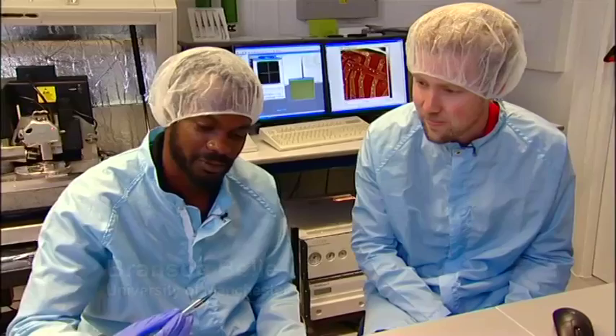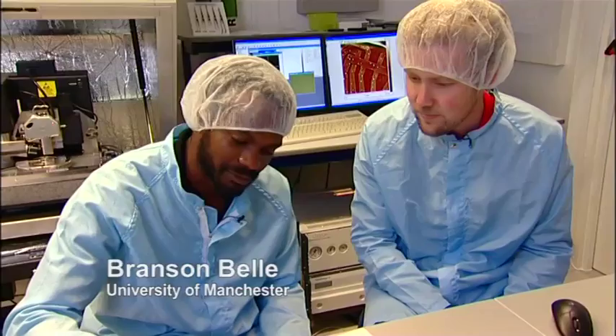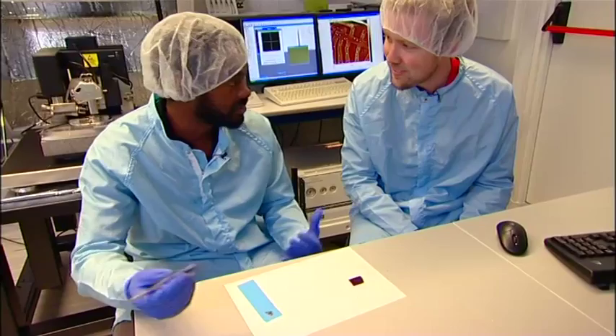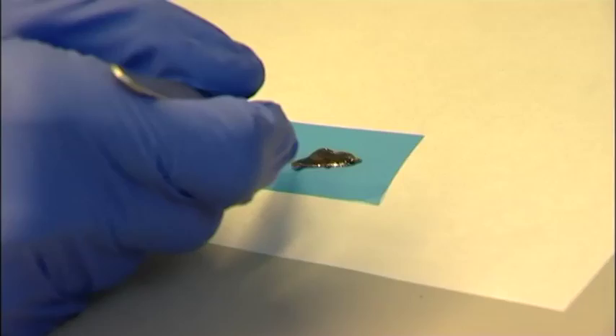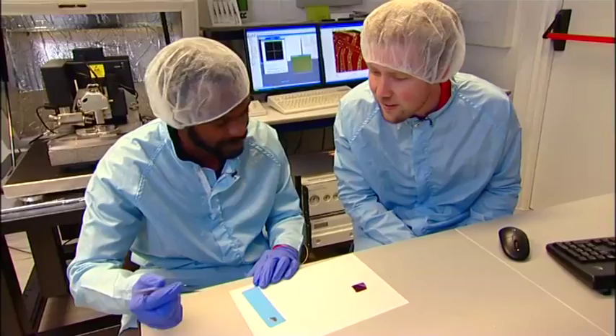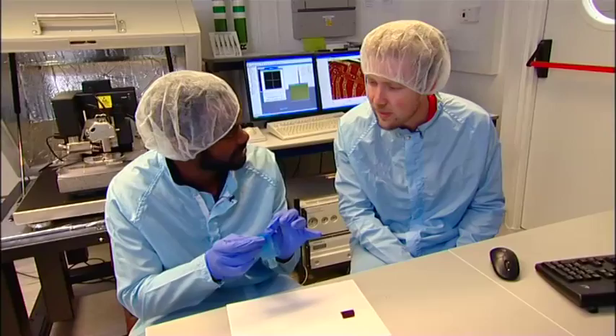I've come along to the lab here in Manchester to learn more about this incredible material. So what we do is we take some graphite and we place it on some tape — sticky tape. You can use standard Scotch tape if you want, but we have a tape here which doesn't have as much residue for our purposes. Then you just press the graphite like this. Press the tape together and you're basically removing a few layers.